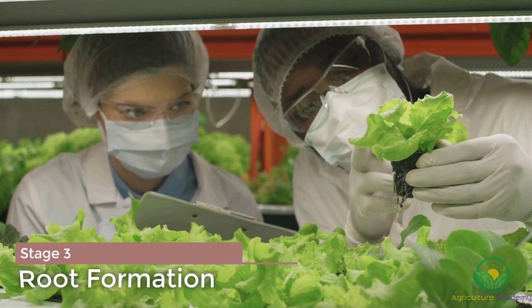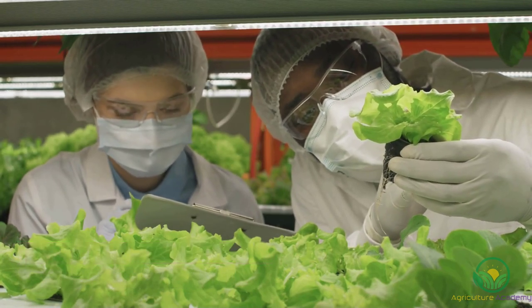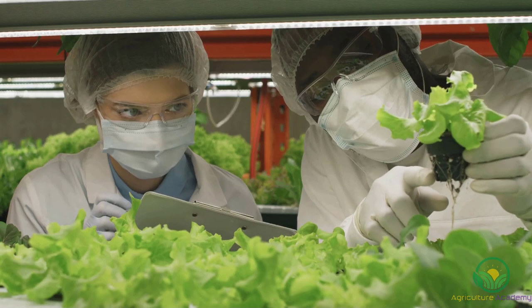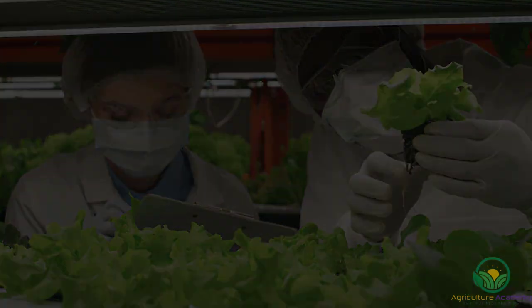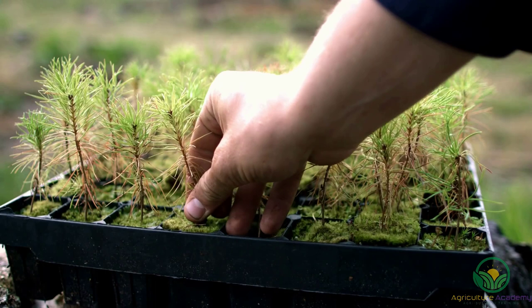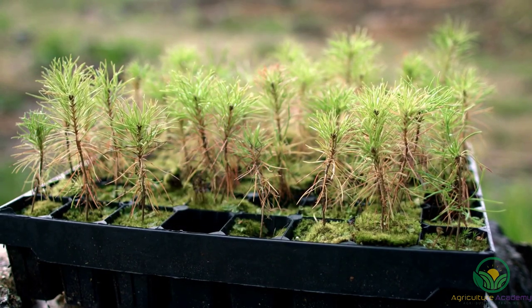Stage 3 can be done in vitro or ex-vitro. For in vitro rooting, the micro cuttings from stage 2 are moved to a root-inducing medium containing less or no cytokinin and more auxin. For ex-vitro rooting, the micro cuttings are treated with auxin and planted into a soilless greenhouse rooting medium. In stage 4, the micro plants that have rooted are transferred from a heterotrophic, sugar-containing medium to an autotrophic or free-living condition, helping the plant acclimatize and adapt to the outdoor environment.